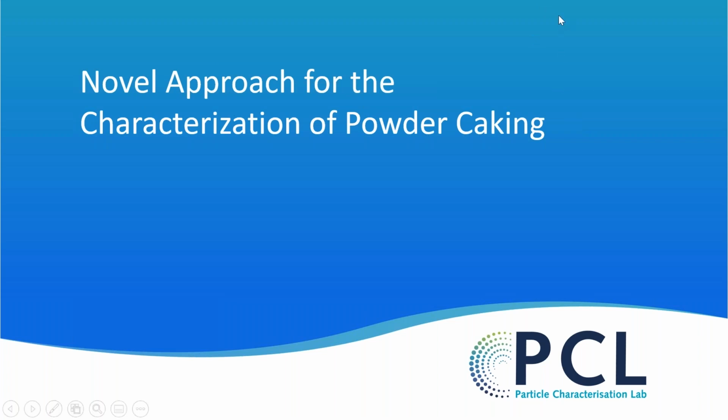Great, thank you. So I'm now going to talk about a different area of research, which is not around DVS or IGC. This is not a technique that was developed by Surface Measurement Systems, but I'm going to talk about a technology which has been developed by Freeman Technology for characterizing powder flow. And we'll talk about the FT4 rheometer in this presentation.